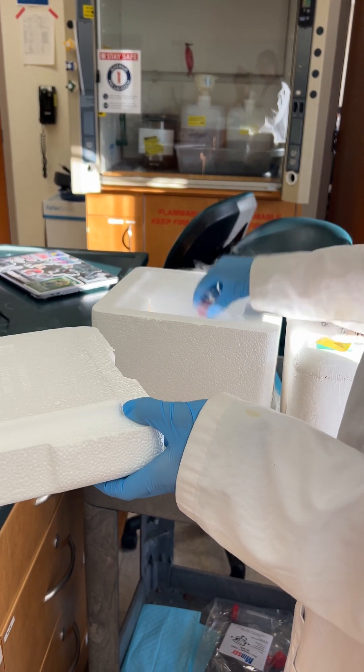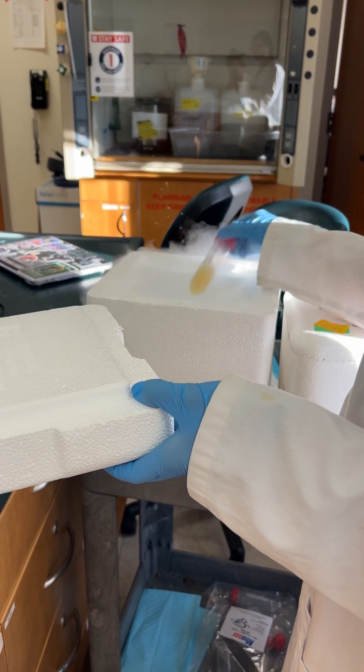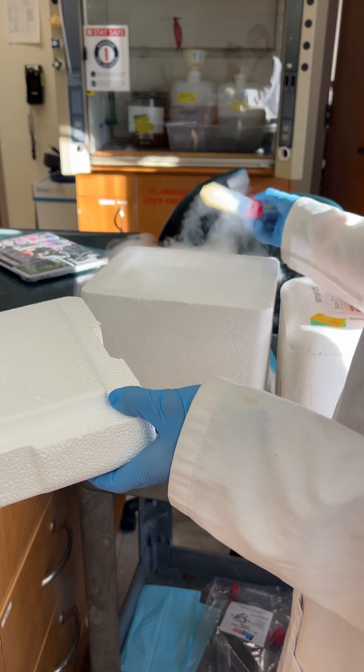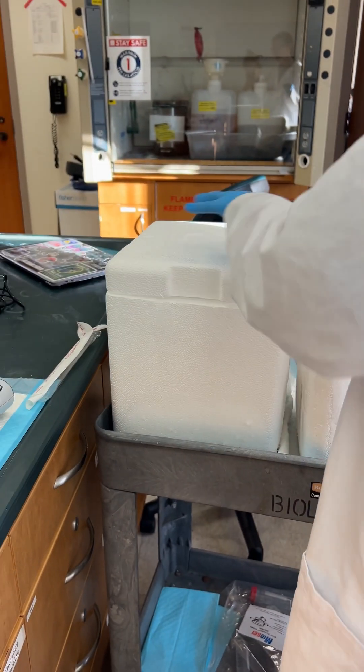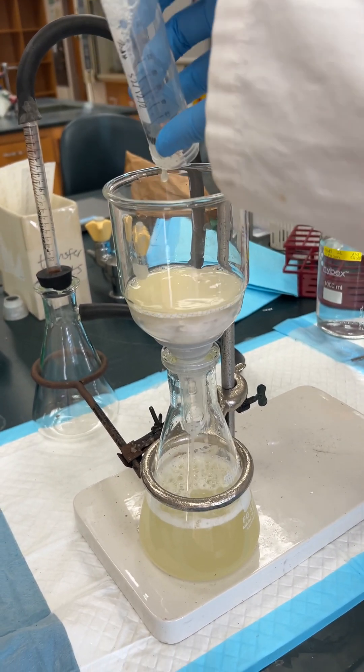So go one, two, three, four, five, six, seven, eight, nine, ten. And then we'll close that, we'll take it over here, we'll dump it right into the filter paper.